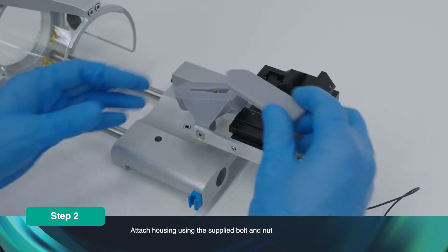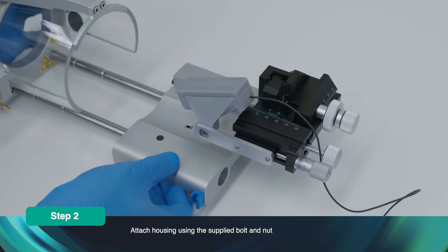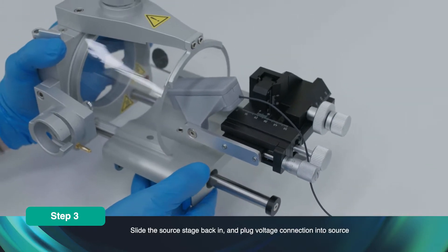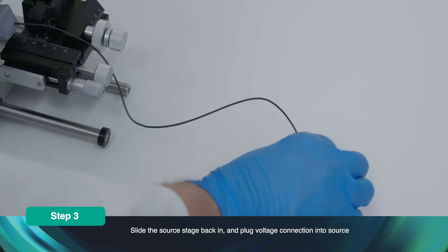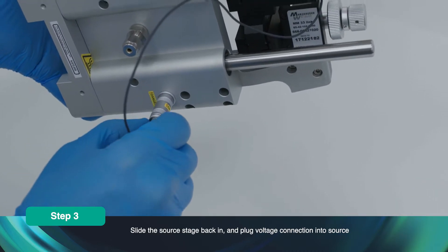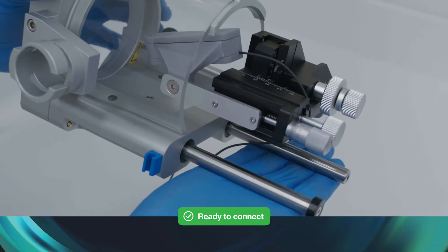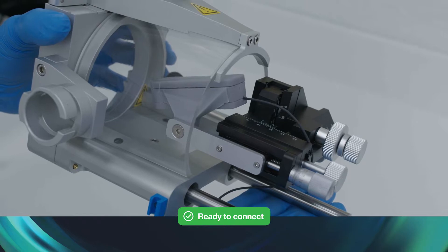Then place the lid back onto the housing. Slide the source stage back in and plug the voltage connection into the source. The source is now ready to connect to your mass spectrometer.